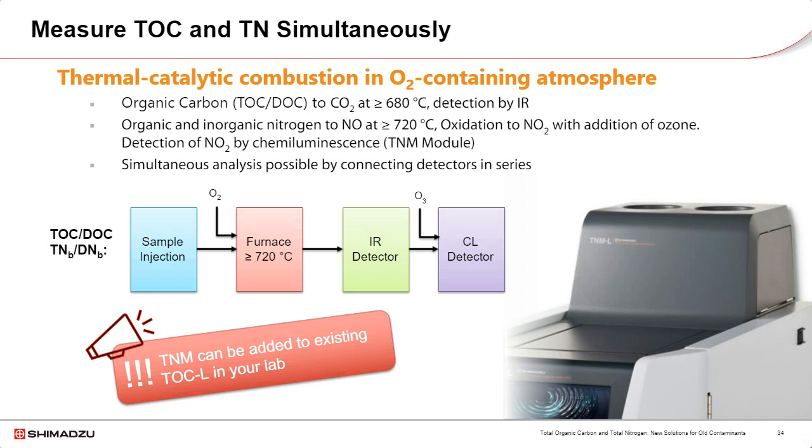The theory behind this is that if the total nitrogen in the sample is less than the limit of TKN allowed, then the sample passes by default. Or labs could run a separate test to determine the nitrate and nitrite values in the sample and then calculate TKN. So TKN is equal to total nitrogen minus nitrate and nitrite.